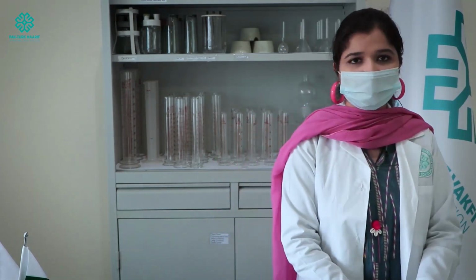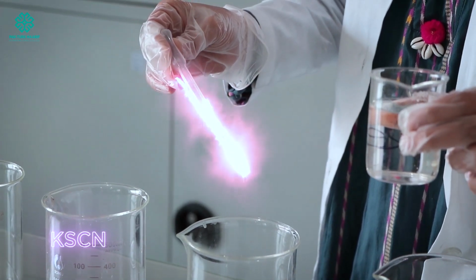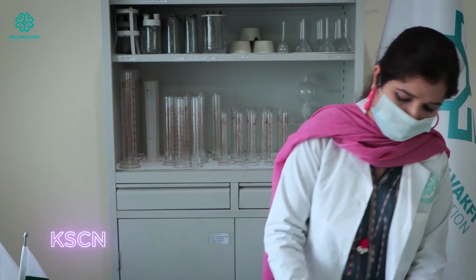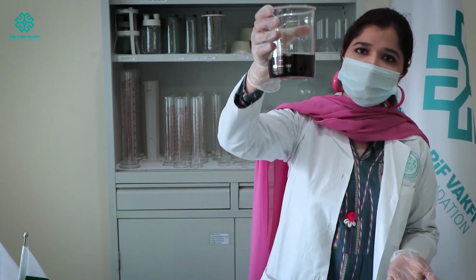Now I am going to transfer this solution to the next beaker, and in this beaker we have 15 drops of potassium thiocyanate solution. Now you will notice the change in color. Why is it so? Actually, in potassium permanganate, the manganese is reduced from +7 state to +2 state, and the ferrous is converted into the ferric ion. So due to this change, you will notice the change in color.